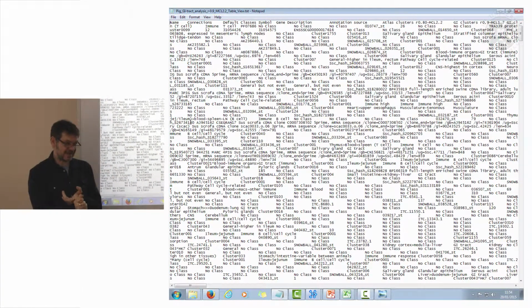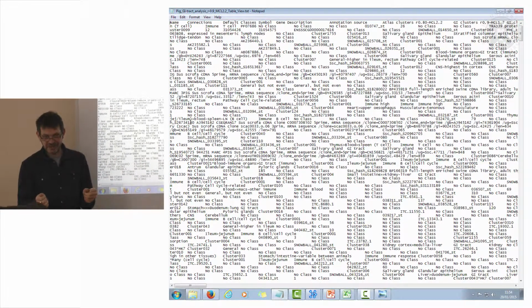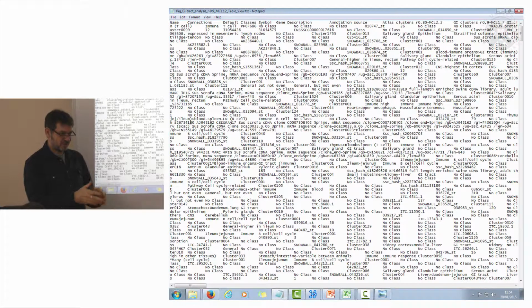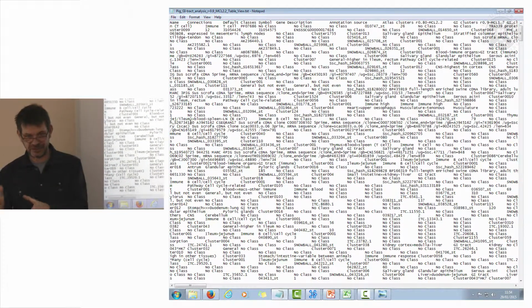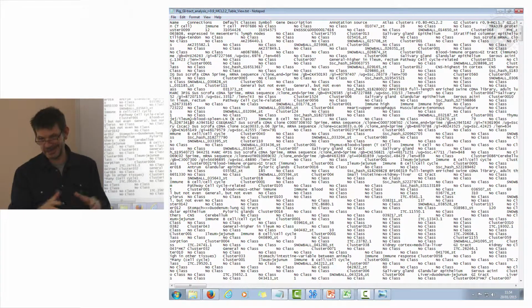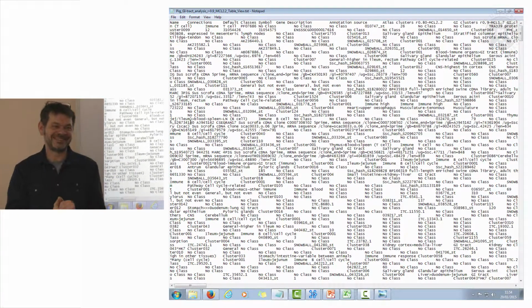That's where you can then take this set of genes and then go and say, what's the GO enrichment in them? Is there a pathway enriched in them? All that kind of interpretive stuff that you might want to do with that set of genes, you can do from that point onwards, okay? Because that's the list. What it doesn't have is a p-value.